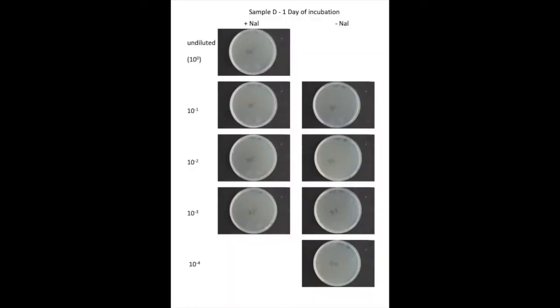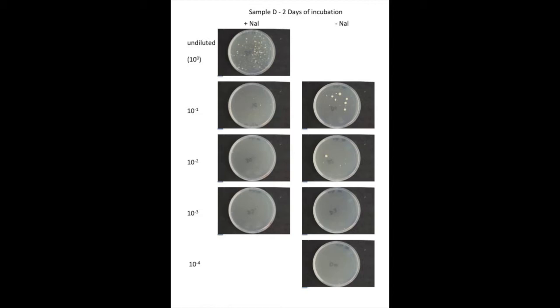Here are our dilutions of sample D after one day of growth at 30 degrees, and now after two days of growth. Colonies are only just starting to appear on the undiluted sample with nalidixic acid, and the 10 to the minus 1 dilution both with and without nalidixic acid. The number of colonies seems similar both with and without nalidixic acid, but the colonies are noticeably larger without nalidixic acid.